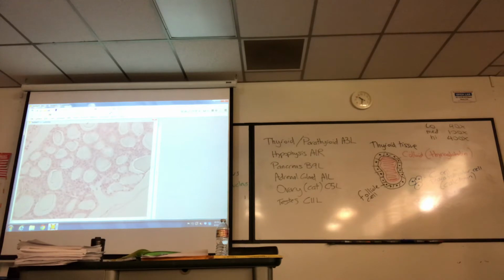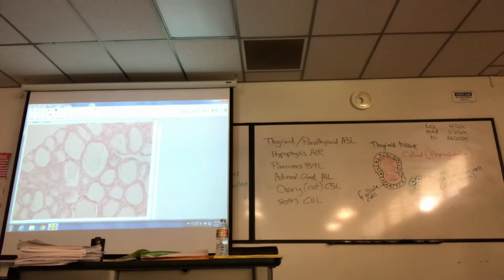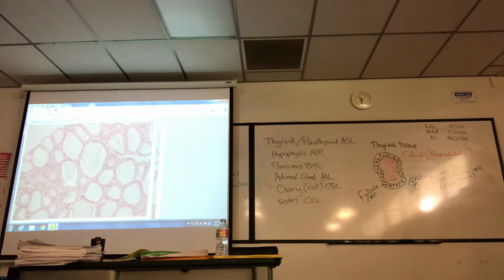It's not really red here. I'm going to zoom around, scan around. That's not bad. I'll take a picture of that. Right, 400x. I'll give you the images. Don't ask me to label them for you. I won't do that, but I think you guys can do that.